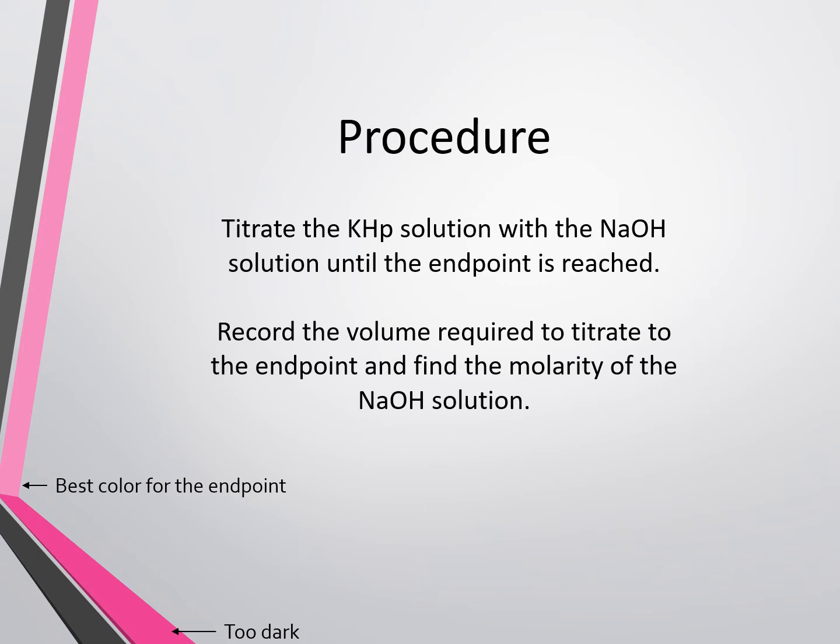So the endpoint that we're looking at for this lab is that lighter pink color that I've shown on the slide. And if you've gone past the molar ratio, you've added too much sodium hydroxide, then you'll see a darker color, which I've pointed to in the slide here. So our goal for the endpoint is to be a lighter pink color.